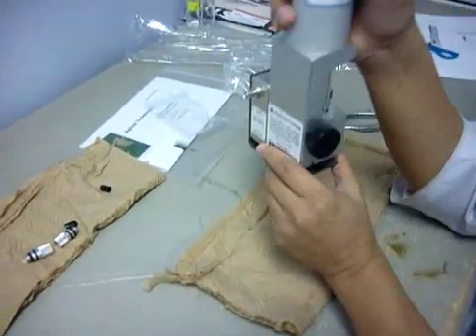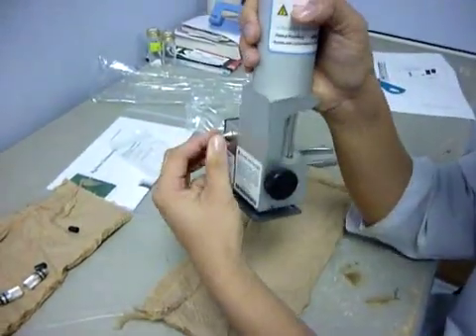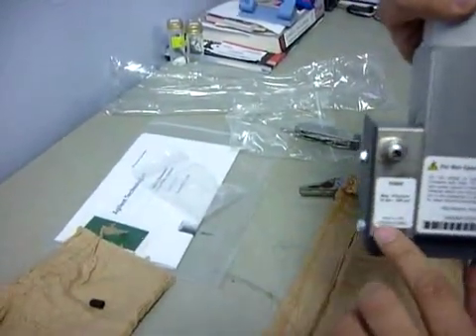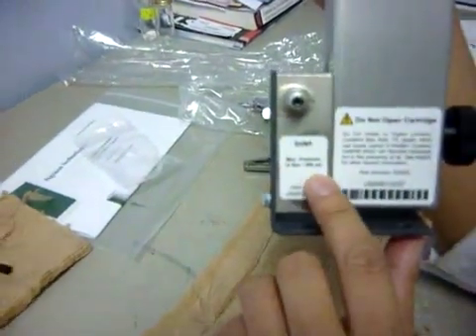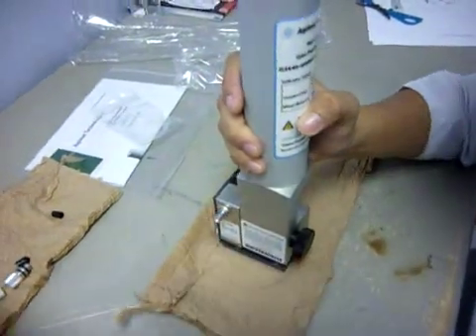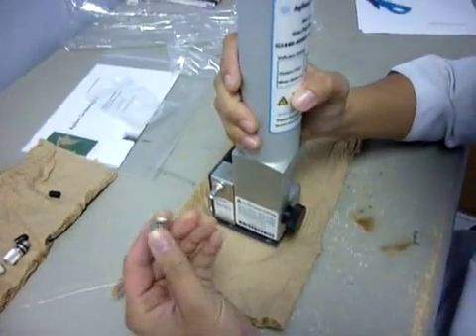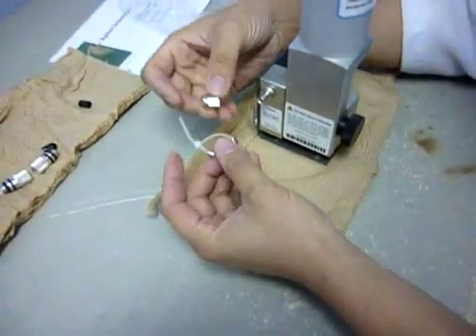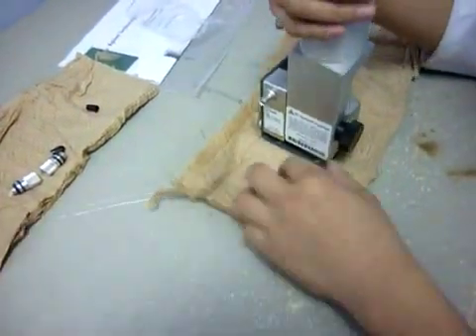This gas purifier is actually for my hydrogen gas, so this will be the inlet of the hydrogen gas. You need to remember that the maximum pressure is 14 bar or 200 psi. They also prepare the fitting — this is 1/8 inch — and also the ferrules. The ferrules and the fitting are included, so in case you don't have them, they have provided them.